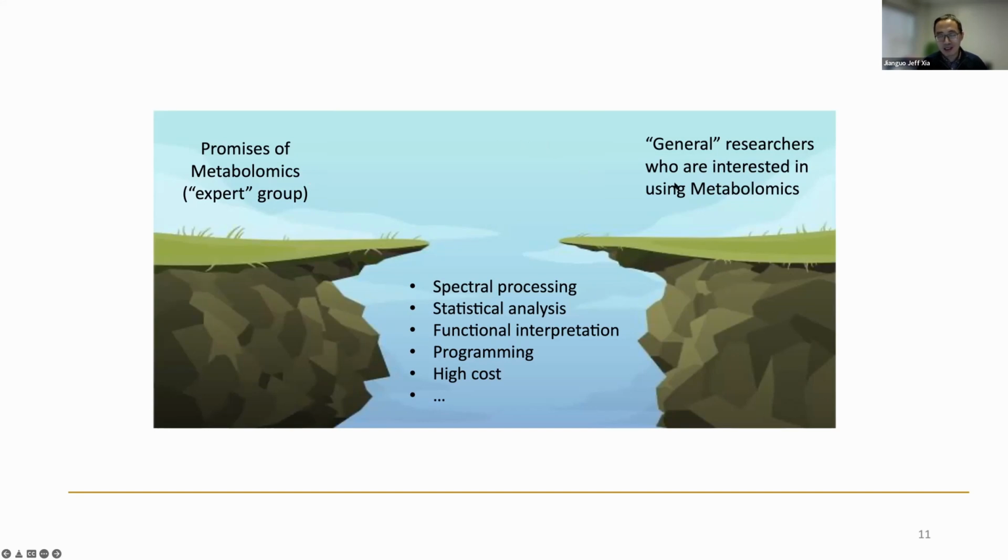Then I realized a lot was not there yet. A lot of people want to do it, but you need to do statistical analysis and normalization at the beginning. Even a simple PCA or PLS-DA was not there, and you need to buy software tools which are not actually designed for metabolomics. So eventually I said, we need to develop the tools for metabolomics, just like what the gene expression microarray did for their tools.